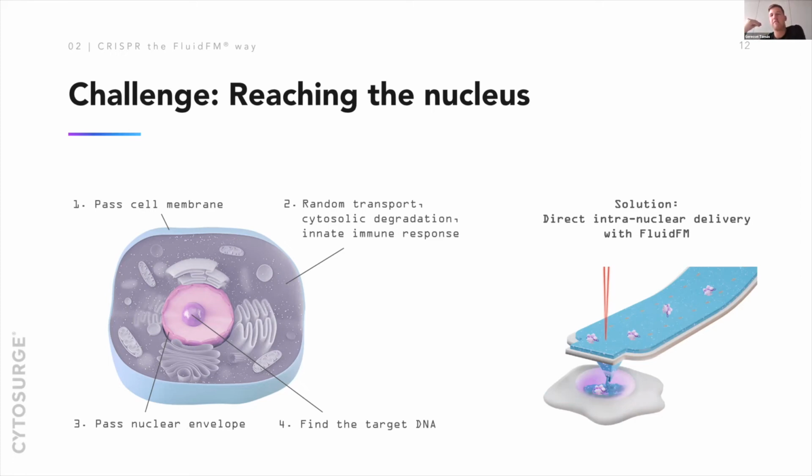Again, here, we almost don't care about what is the cell type, since from a mechanical point of view, most cells are just bags of protein, and we can pierce these bags of protein and then insert the material into the nucleus. Therefore, this method works with many different cell types, even very sensitive cell types, including some primary cells or stem cells, which would be quite difficult with more brutal methods. So the gentle but direct reaching of the nucleus is one of the main advantages here.